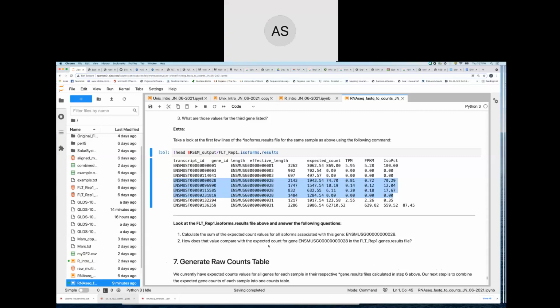I think you may be able to save the output of Unix head to a variable that is accessible by Python, and then access it by Python in the next cell. So I don't think you can directly pipe it, like have Unix head and pandas in the same cell, but I think you may be able to have variables transfer between. Why don't you try it and see and let us know?